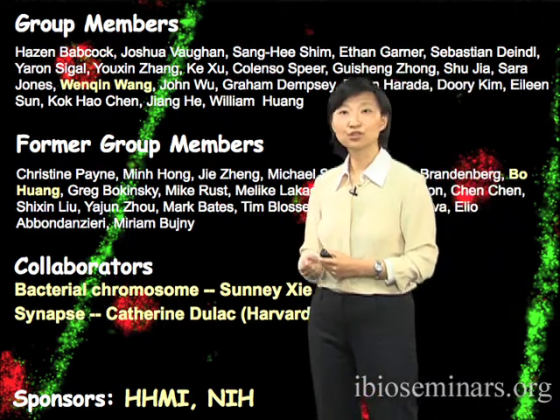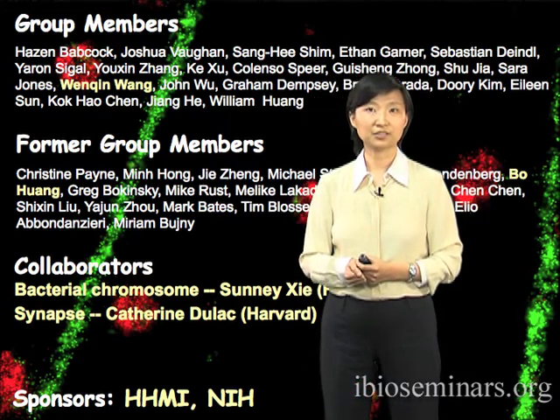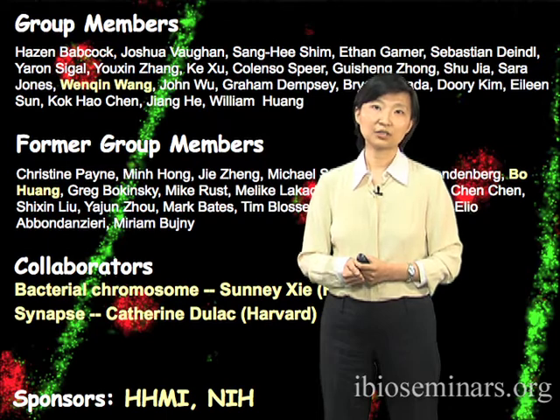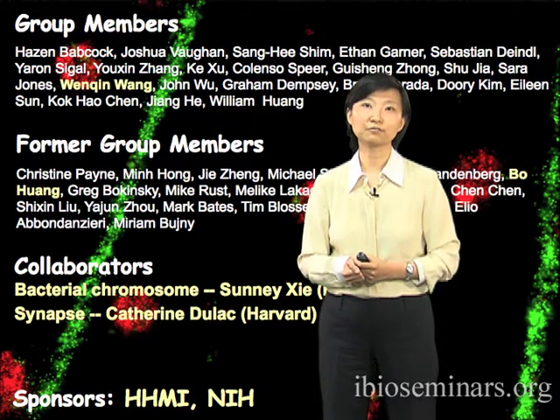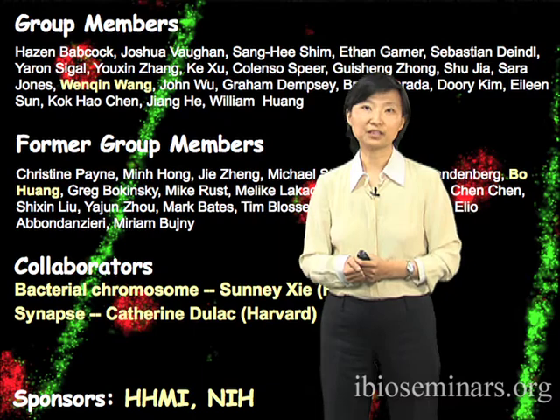And this concludes the second part of my iBiology seminar series. And then the third part will be on single molecule FRET study of a couple of biological systems that are involved in gene replication and expression and regulation and so on.